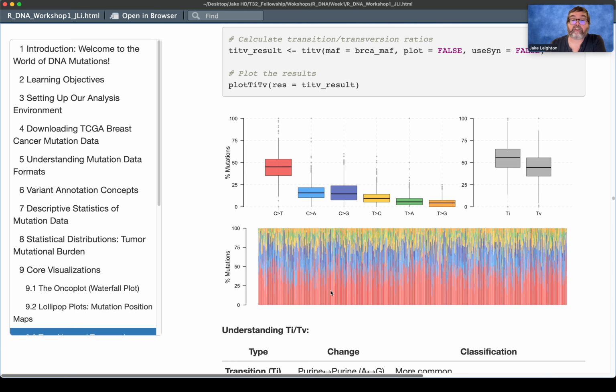But really, the structure of the mutation patterns is what tells you the difference. So you see, like, C to T, for example, is a very common mutation for everybody. The most mutations are always there. Then you see the different ones that have been changed, and you only see 6 here. You're like, well, how could there be 6? Shouldn't there be 12 different types of changes if you have 4? And you're thinking, yeah, that is true.